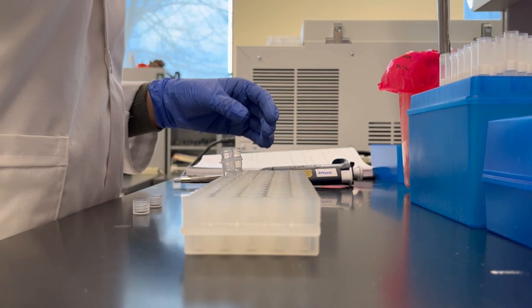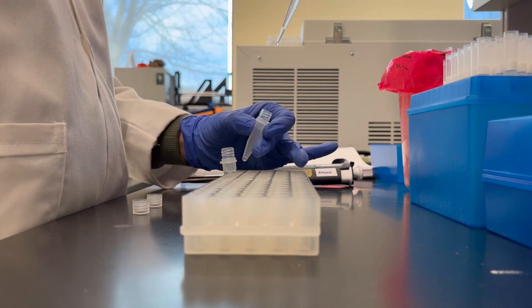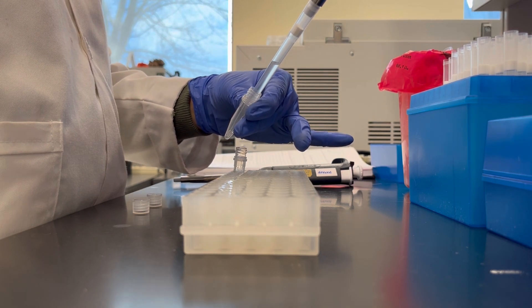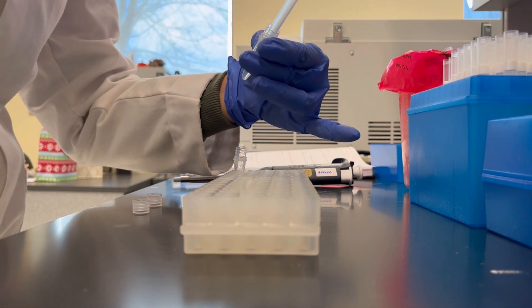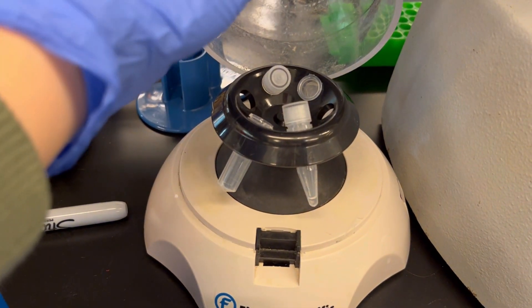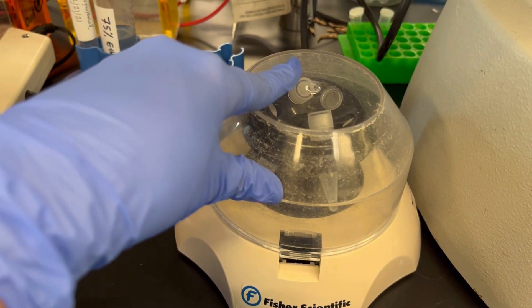After centrifugation, discard the ethanol. Spin the tubes down again to get rid of ethanol as much as possible.